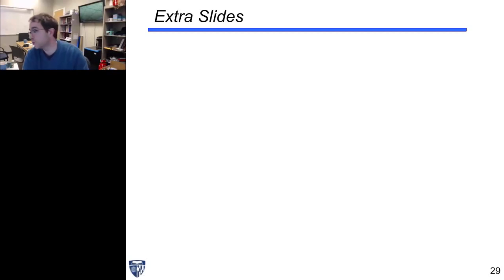Short answer, no, currently. The reason is that when you're capturing such a small part of the genome, a megabase or so, that's 1/1000th of the genome. When we put a microgram or so of DNA into that, we're only saving 1/1000th at best, if we had 100% efficiency. So we'd only have something like a nanogram of DNA back out. That's just not enough with our current methods to sequence.